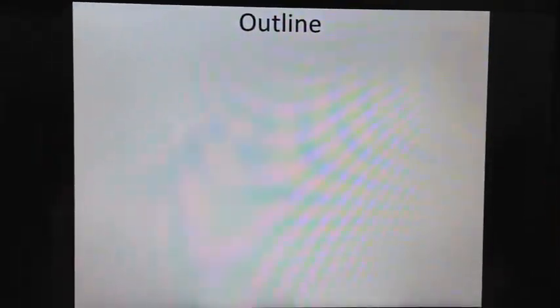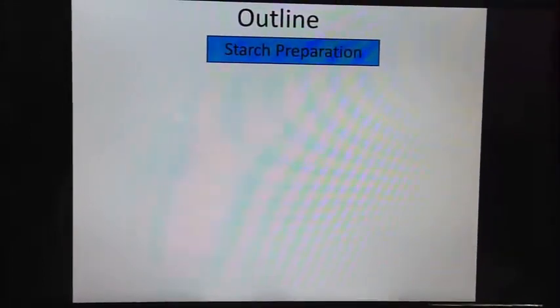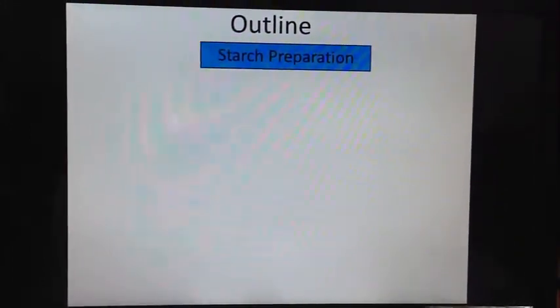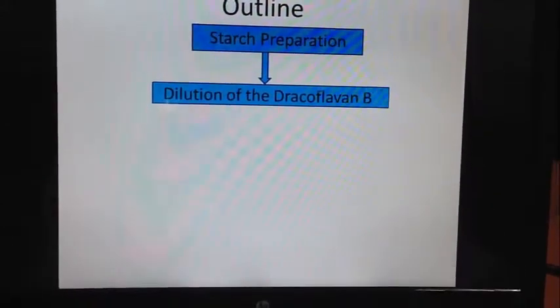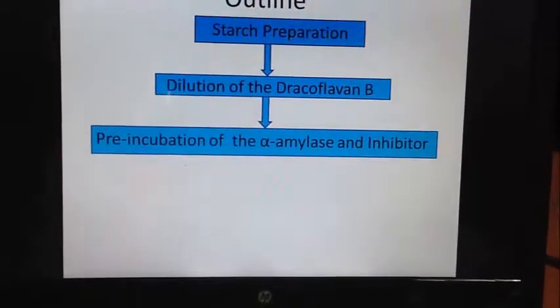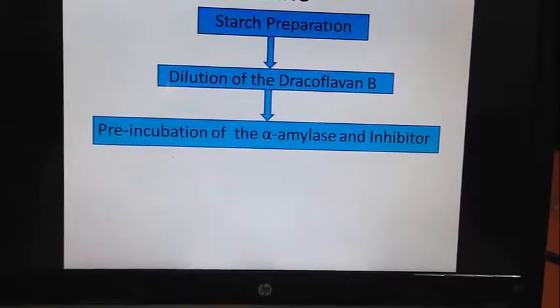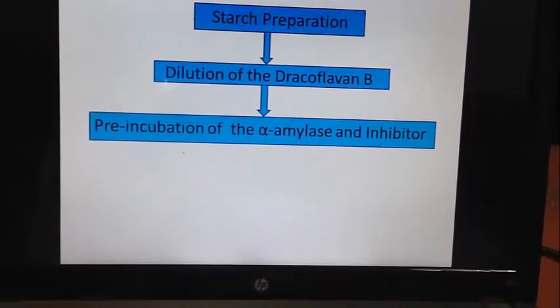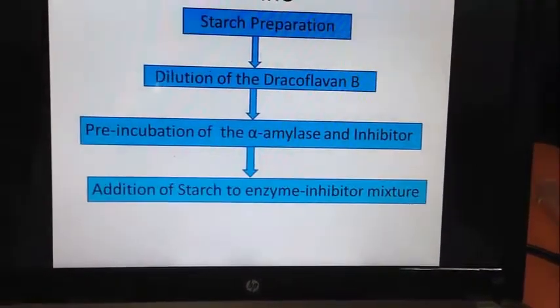My video presentation involves 5 parts. Part 1, I will talk about how we prepare the starch. Part 2, we will focus on the serial dilution of the inhibitors. Part 3 involves the pre-incubation of the alpha amylase and the inhibitors.